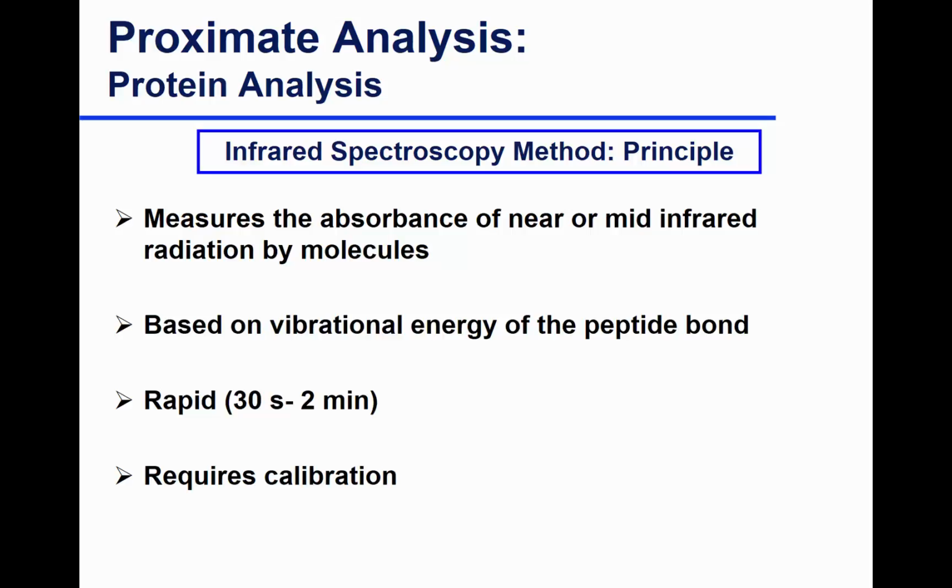When we talked about absorbance on Monday, what do you remember about what wavelengths proteins absorb at? What was that? 220. As we're going to talk about on the following slides, the aromatic amino acids, tryptophan and tyrosine, absorb at 280, where the peptide bonds themselves absorb at 220. So you're getting a slight difference, and if you go back and look, on Monday we talked about why you would sometimes choose 280 versus 220.